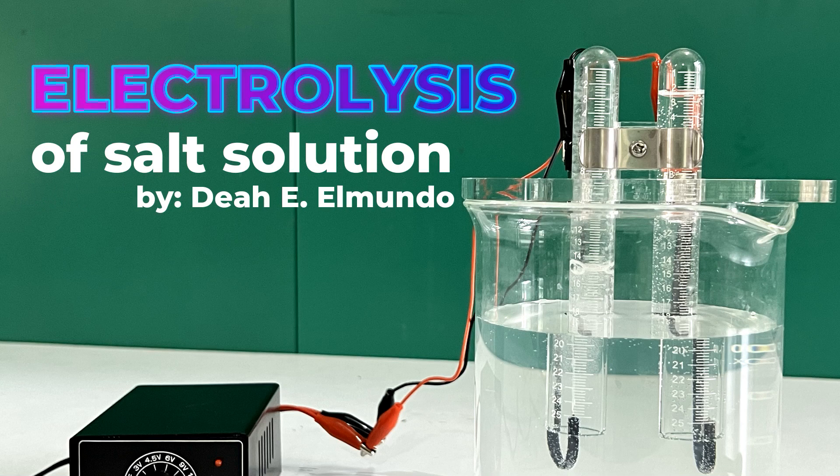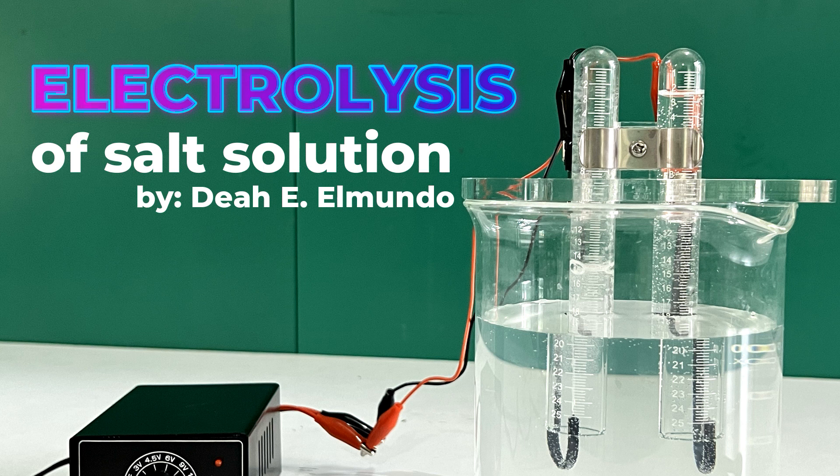Hello everyone! Today, I will be showing you how to perform the electrolysis of a salt solution.